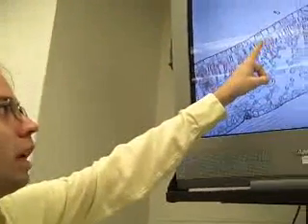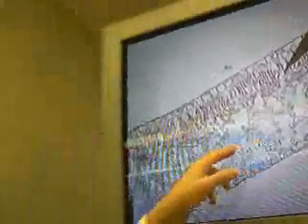On this particular slide, the red color represents chloroplasts because our chloroplasts have been stained red. So this red layer here is the palisade mesophyll. The primary purpose of our palisade mesophyll is to do photosynthesis. That's why it's so heavily pink in color. This layer right here is the spongy mesophyll. Spongy mesophyll has a lot of air spaces. It's very loosely packed. The spongy mesophyll's primary purpose is to absorb carbon dioxide. That's why it has so many air spaces. Carbon dioxide can circulate through and get dissolved and absorbed by the different cells.